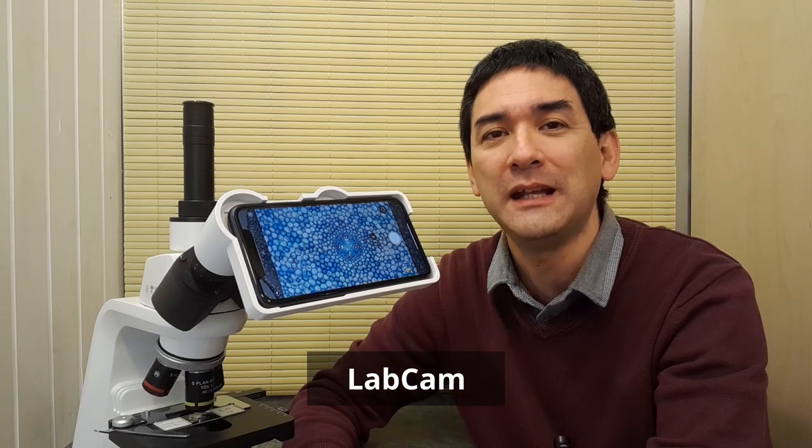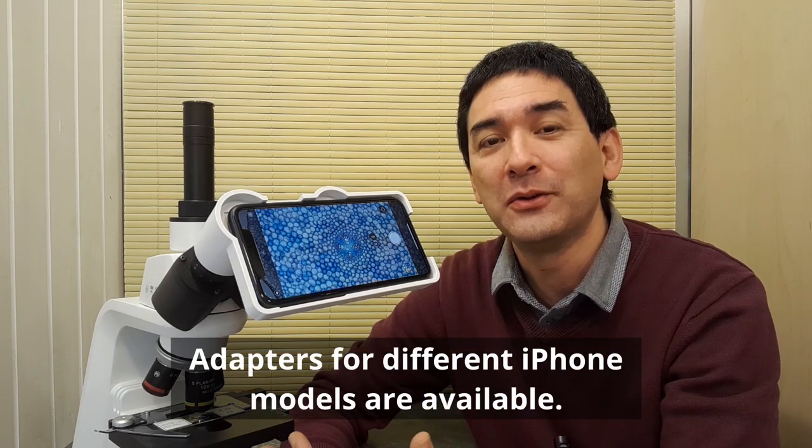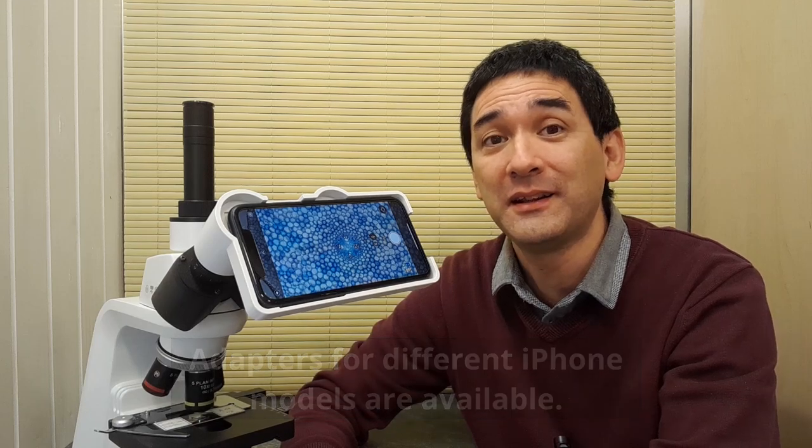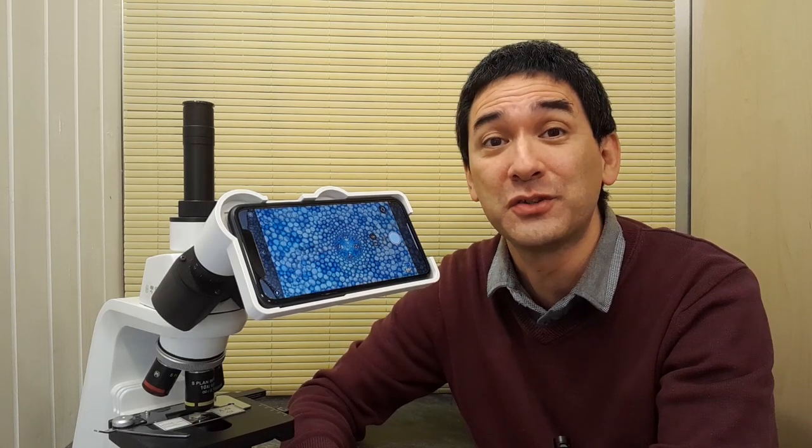In this case I've got the iPhone 11 connected here and I would like to also thank the company who sent the adapter to me. I'm not paid to do this review.